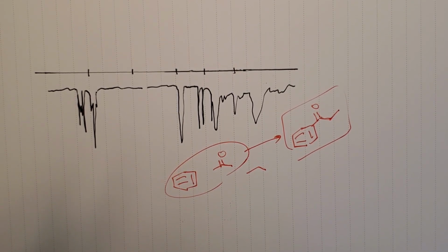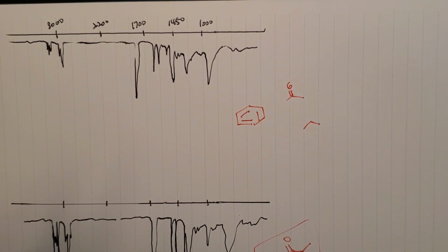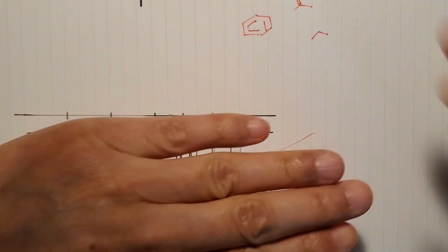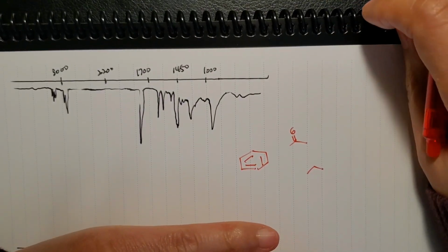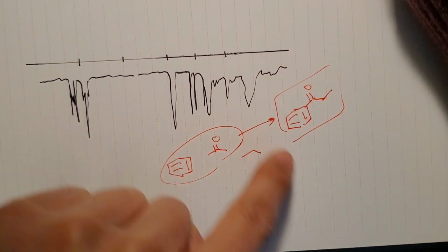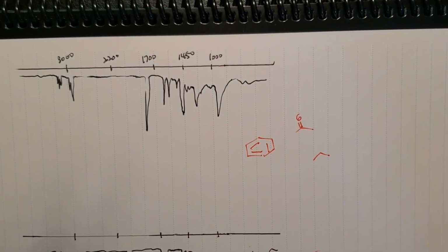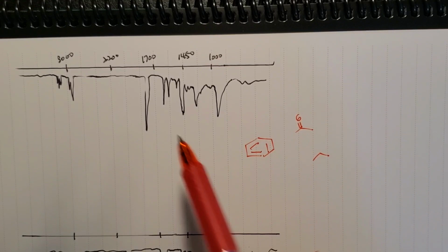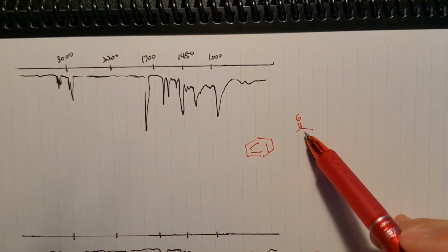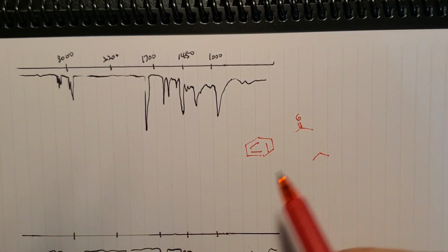All right, so go back to the previous one. Now you know what you should be doing before you had this in your mind, right? Even when you solve this, you should be thinking about this situation to avoid the mistake of making up this one. So here you have these pieces, but you don't want to put them together because the rings are not polar and the hydrogens on the rings are also not polar. Also, the carbonyl is giving the typical carbonyl number. So it's not a conjugated carbonyl, it's a typical carbonyl.